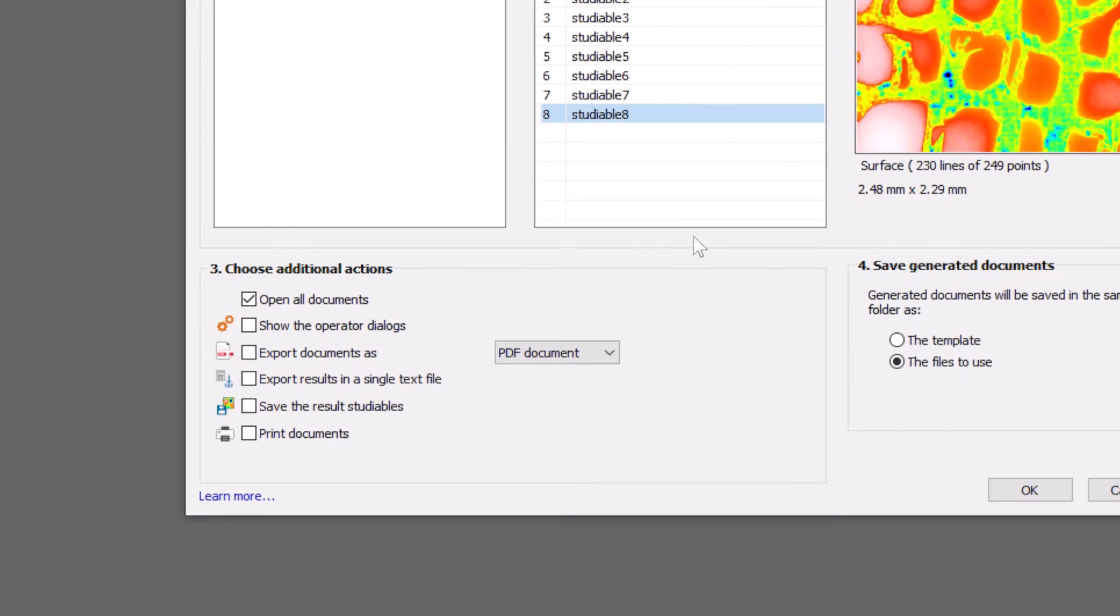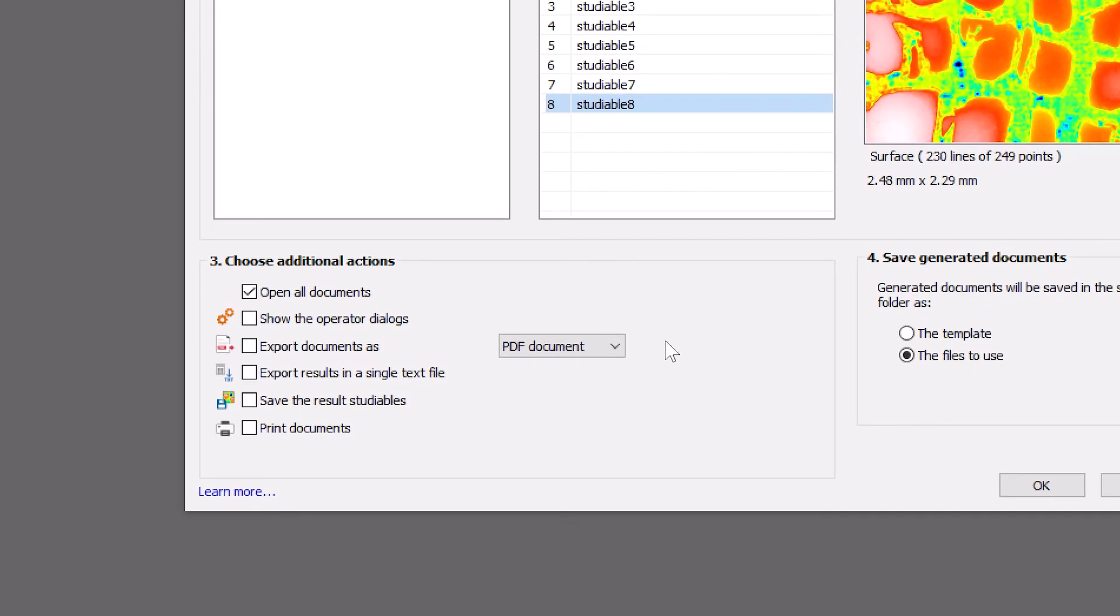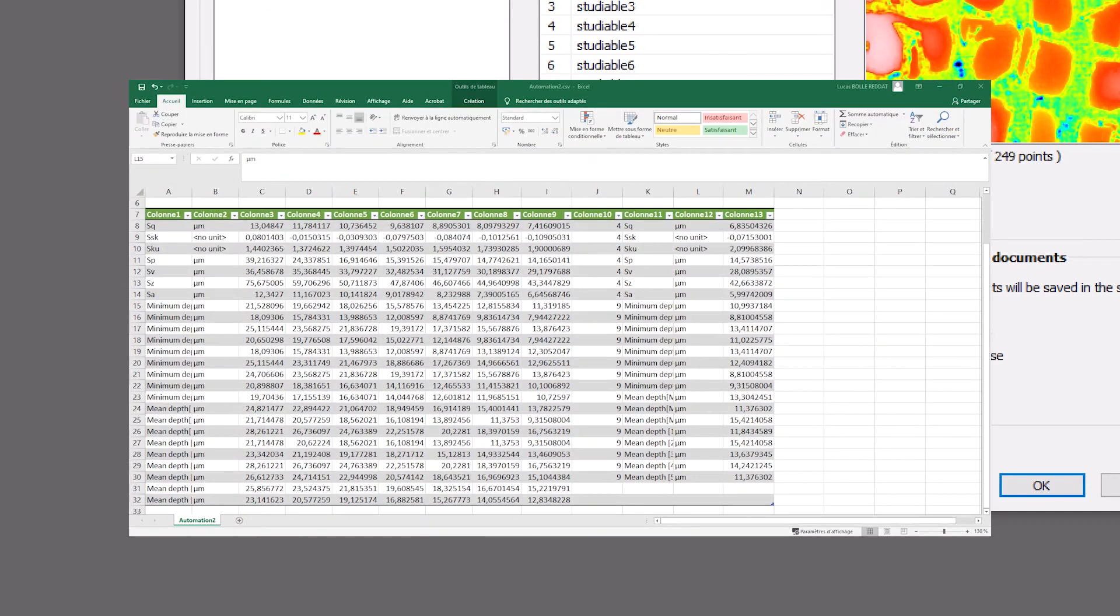Note that Mountains gives me access to a wide range of choices for exporting my results, such as exporting documents as PDF files, or exporting numerical results to Excel.